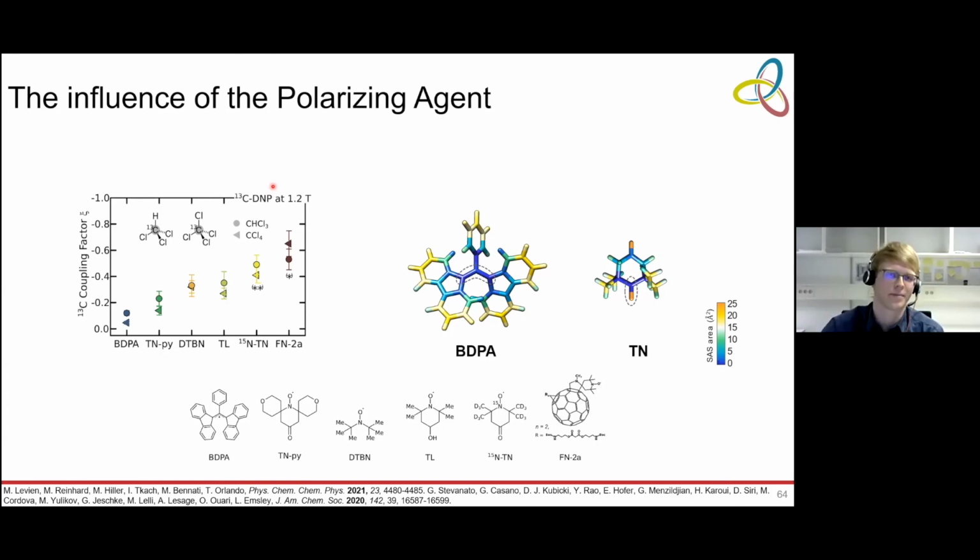It's a very promising pathway, I think, because your prospect is much higher, because if you use a triplet state, your saturation factor can be much higher. However, the way is also very long, because little is known about this. But I definitely think it's a way to pursue. Because you can also use a laser, for instance, instead of microwaves.